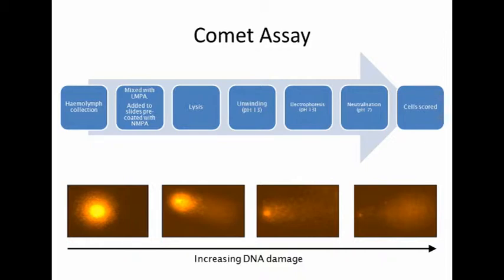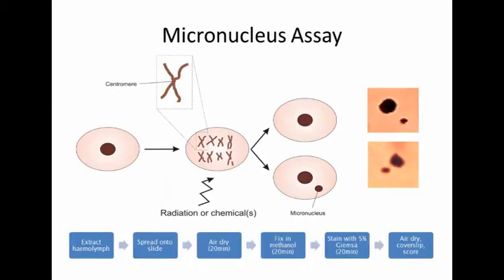This cell here has not been damaged at all, as from a very healthy looking mussel. And what we do is we look at the percentage of DNA that's actually been broken. So you can see here that there's not very much intact DNA, there's absolutely shed loads of damage. So that indicates that this mussel was having a hard time of it. And these effects can be correlated, like I said earlier, to things higher up, which might be of more relevance to you guys. But this effect would be seen much quicker than a change in population. So it's kind of an early warning signal.